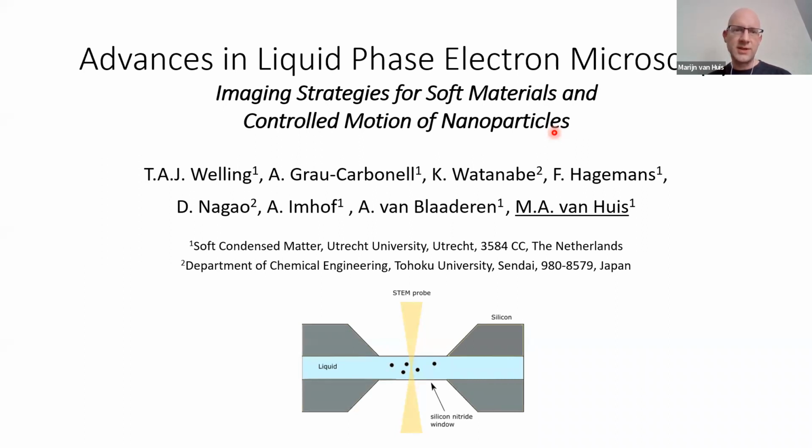So the subtitle is Imaging Strategies for Soft Materials. That goes mainly for the p-NIPAM particles that we are analyzing, and controlled motion of nanoparticles. And those are typically rattle particles. So there is a movable core within a shell, and we can control the motion of this core.